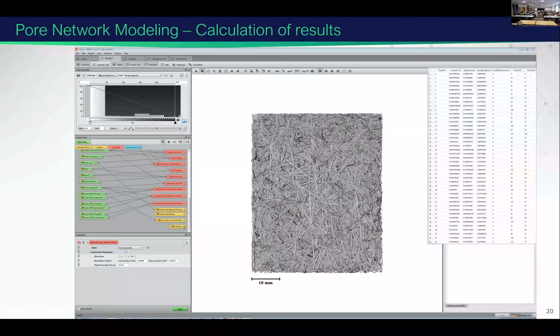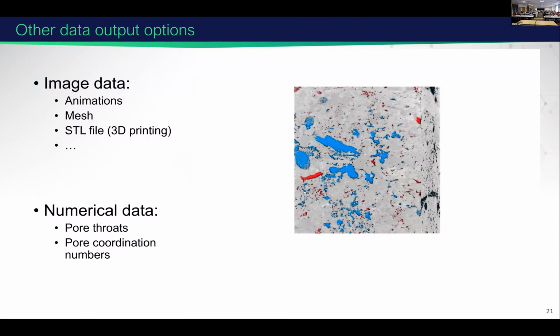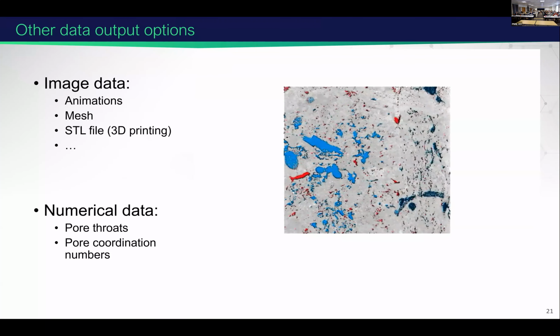We also calculate how each individual pore is connected to how many other pores. We get all that information as well. Further, we get the flow in each particular channel, and we can calculate that too. And from here onwards, Thomas will continue his talk.